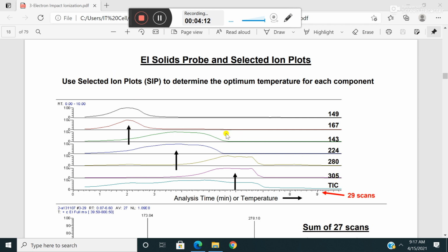So what does it mean? It means that in a mixture we have different compounds that give the molecular ion peak at different temperatures. At a very low temperature, some of the components will not ionize; they would need a very high temperature to go to the excited state, and then ionize, followed by dissociation and fragmentation.